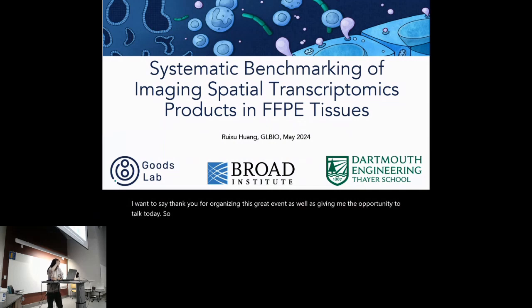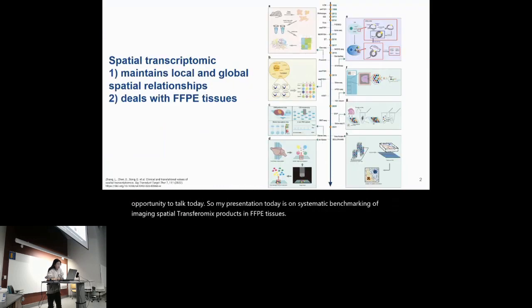So my presentation today is on systematic benchmarking of imaging spatial transcriptomics products in FFPE tissues. So spatial transcriptomics, as you all probably know, has rapidly evolved in the past few years. It's a technology that essentially measures the gene expression profiles of tissue or cells in situ.